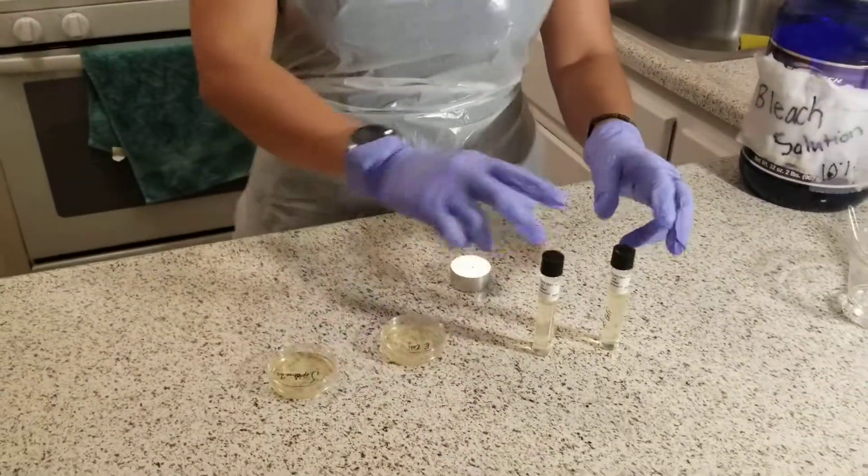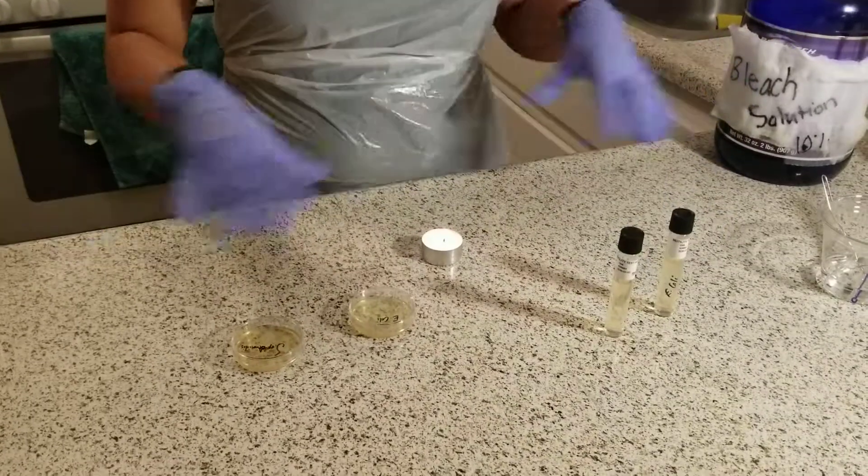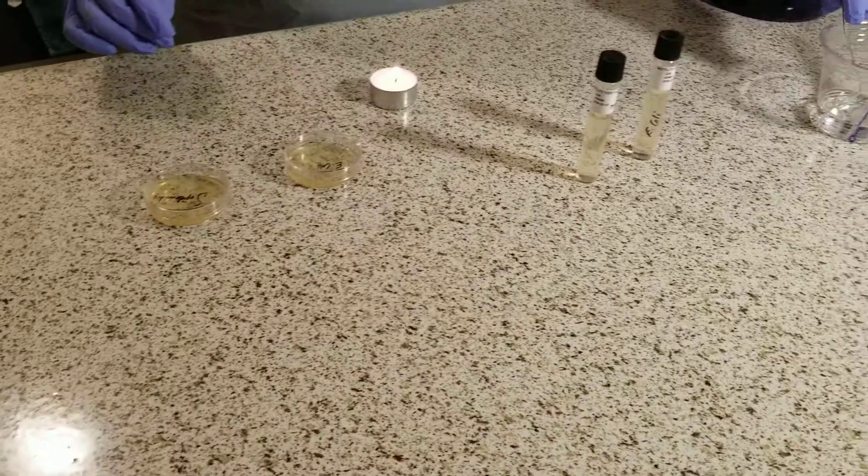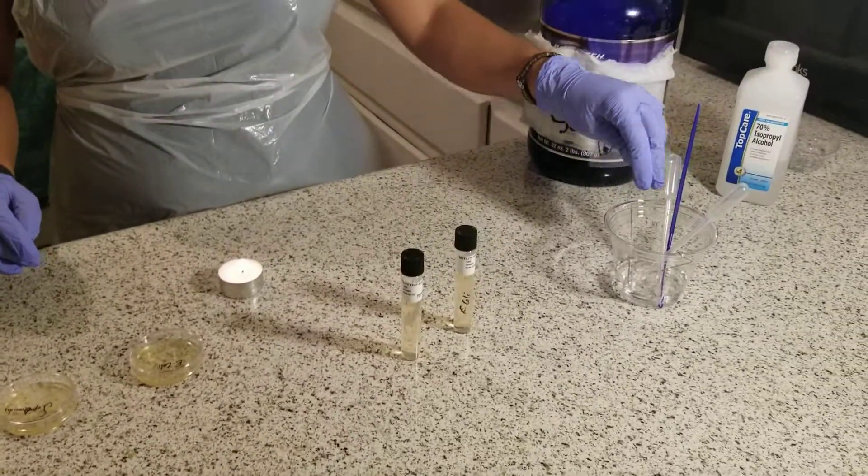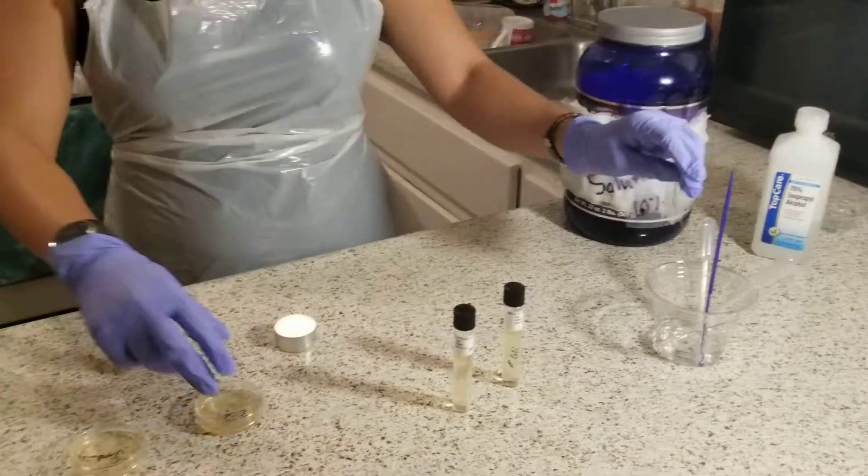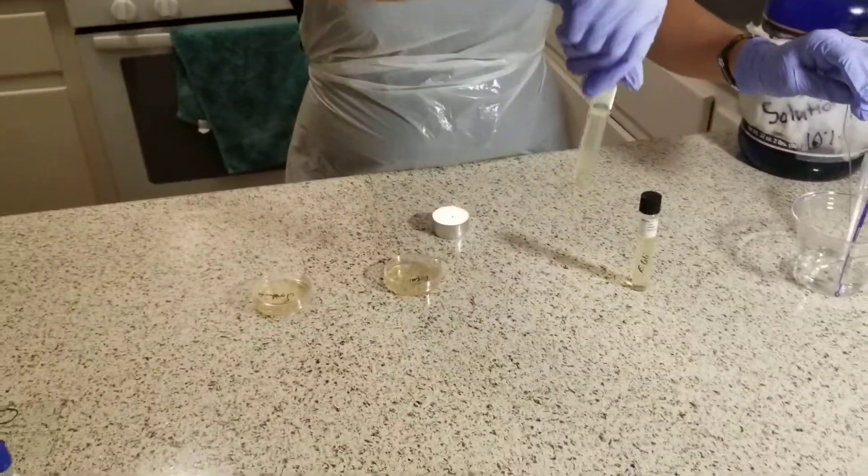First, I disinfected my workspace with a 10% bleach solution. I have two paper clips here that will be sterilized in alcohol, and I'll demonstrate the motility test with E. coli.